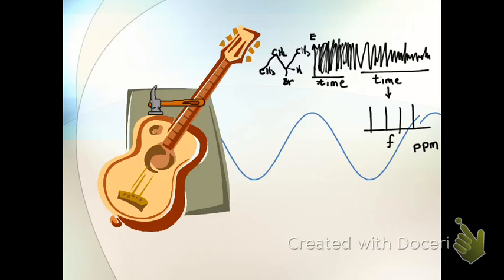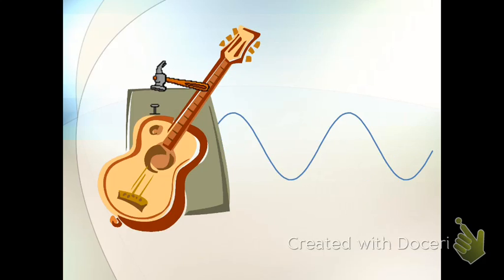And unusually, as is many times the case in spectroscopy, 0 is on the right-hand side. And to the left is where we plot all our signals. And typically for hydrogen NMR, this can go up to about 15, but is typically less than 10. Okay, so let's look at some of the things that influence the NMR signal.